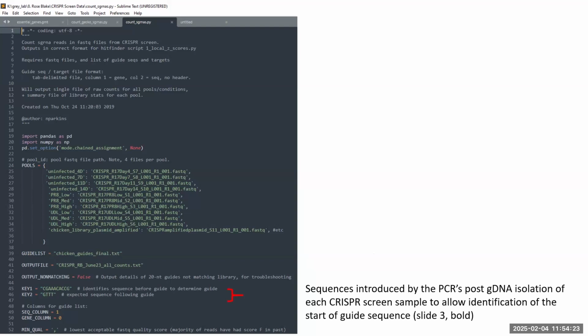For the most part, everything has to be in the same folder. So the script, sequencing files, and your library, you've got them all in the same folder, and you load up Spyder, and you just make these small changes, and you just hit run, and that should generate your Excel file that will go into the same folder. So that's that step. If you're doing slightly different sequencing with a different platform or whatever, you might need a little bit of help from a bioinformatician just to get past this stage.